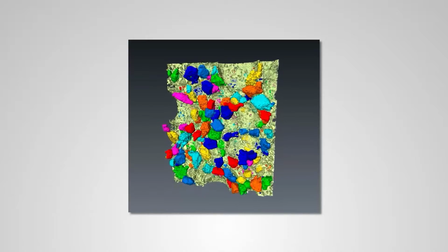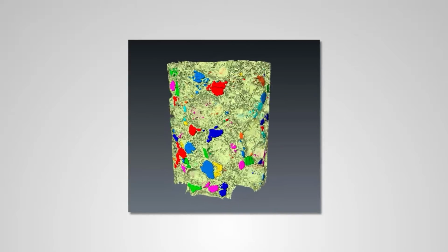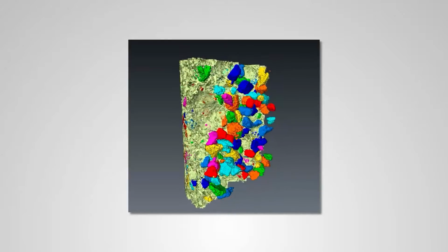Using these rigs, we can replicate all sorts of real-life conditions, from high pressures and temperatures deep inside the Earth to the wear and tear on an engine in use. We used X-ray tomography to look at the structure of ice cream as it warms and cools. We discovered the ice crystals inside grow and change shape. This affects the way they interact with the taste buds on your tongue, changing how it tastes.